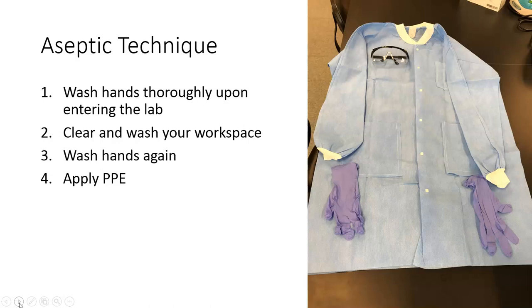Whichever chemical you use, it's most important to pour some onto the desktop surface. Use a paper towel to move it around, but don't use the paper towel to dry the desktop. The amount of time that the chemical has on the desktop is actually going to increase how many microbes get killed. So we want to let these chemicals evaporate rather than wiping them away so quickly.